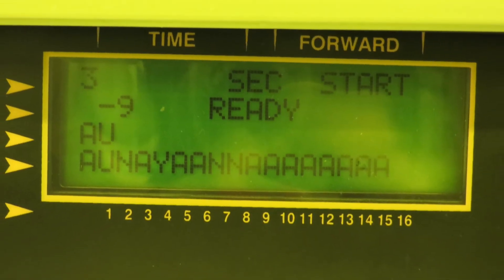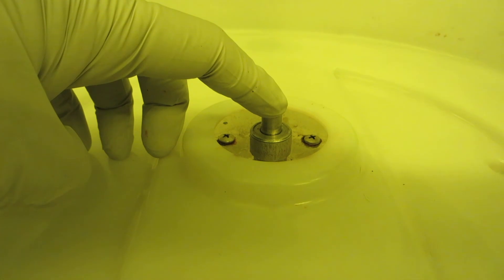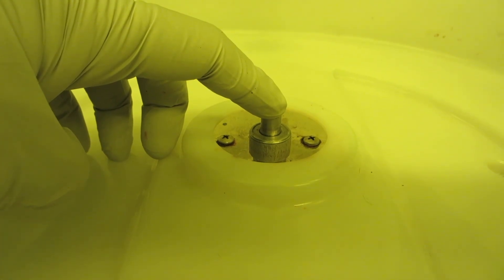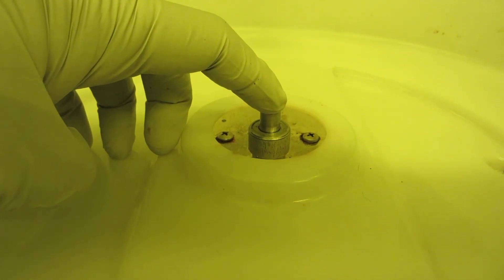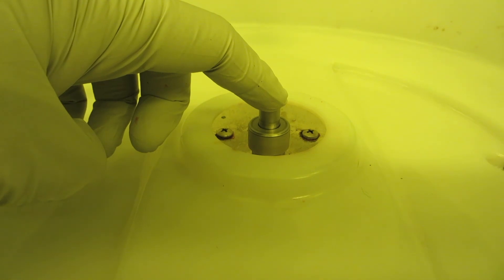Please don't try to fix this yourself if you think it's clogged, because it may actually cause more problems. If the vacuum shaft seems to test out okay vacuum-wise, but your sample still flies off, other things you might want to check is to make sure that the O-ring is in the bottom of the chuck, and also make sure that there's no little bumps of maybe a drop of resist on the bottom of your wafer that are keeping it from laying flat.